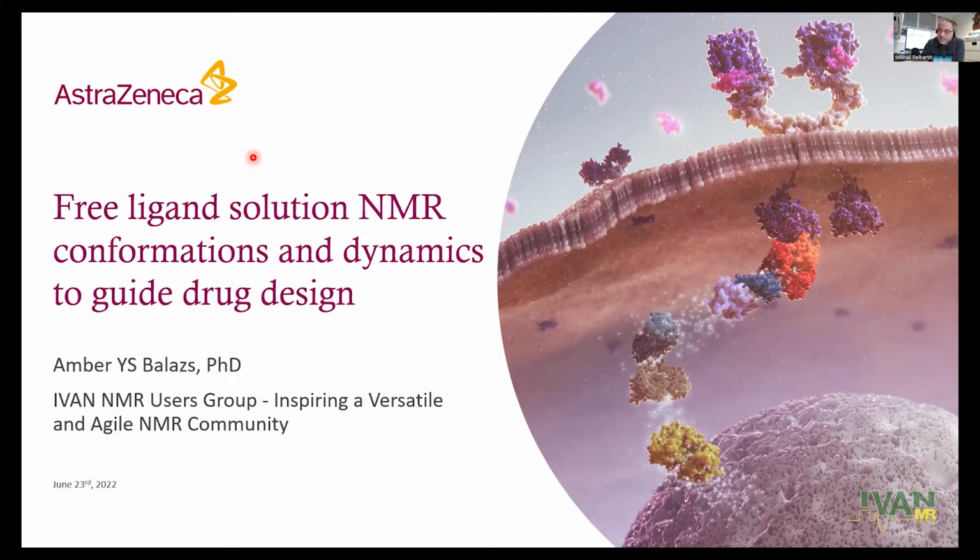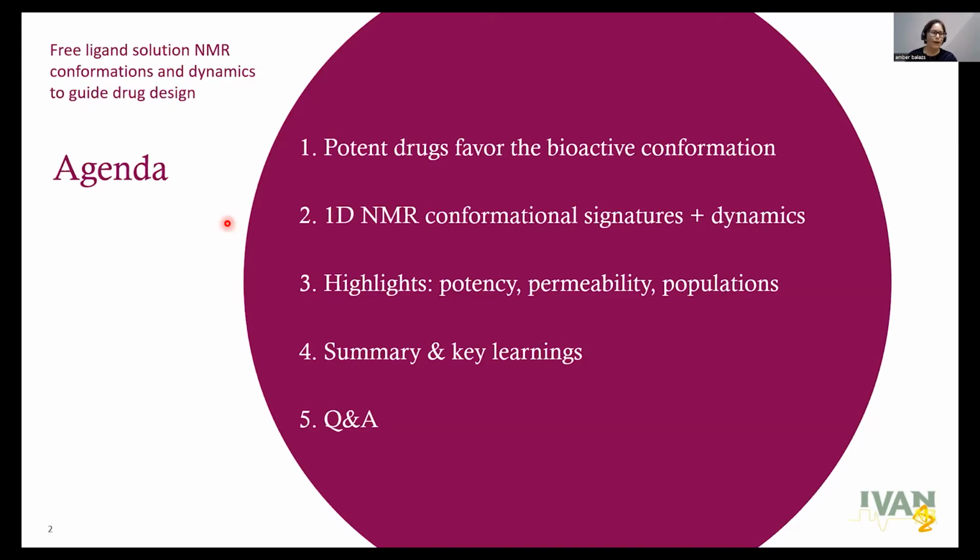Amber, please go ahead. Thank you, Misha, and the organizing committee for this opportunity to talk about our NMR free ligand conformational platform at AstraZeneca. What is on the agenda? First, a brief introduction to our working hypothesis that potent synthetic drugs free in solution favor pre-organization into the bioactive conformation. This is a guiding principle.